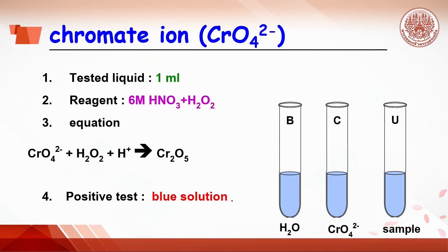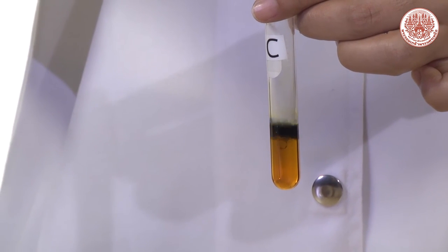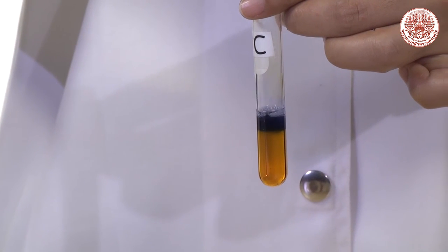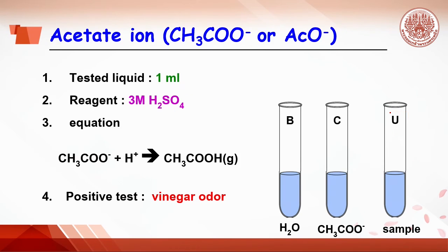Next comes chromate ion test. Do the same by adding water, chromate ion and sample, 20 drops each. Then add nitric acid and hydrogen peroxide. The control tube will show the positive test where the solution turns blue. Observe the color change in the U tube.